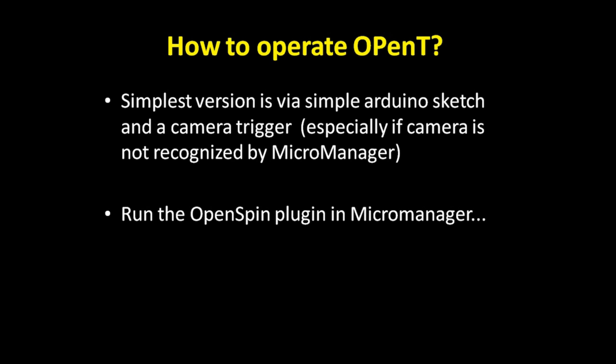It's very simple to program, and little programs for Arduino are known as sketches. You need to get a camera that accepts an input trigger. So the Arduino basically tells the camera to acquire an image, tells the motor to rotate to another angle, acquire another image, and that's just what you need to automate while you're acquiring images.